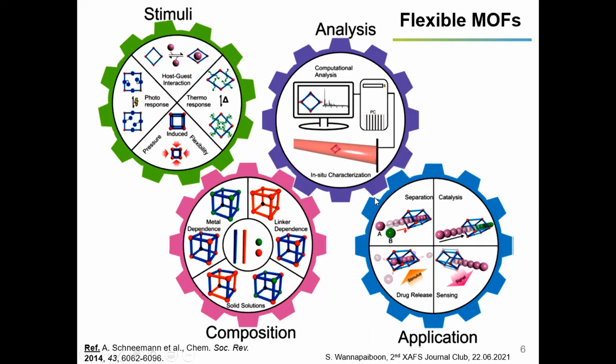And to get into the details of what the structure of MOF is, it requires in situ characterization and also high-performance characterization techniques, for which we mostly use synchrotron facilities in the characterization methods for this kind of MOF.